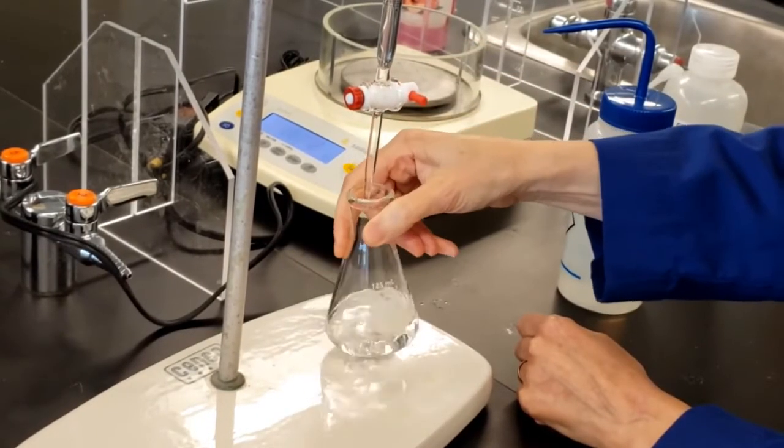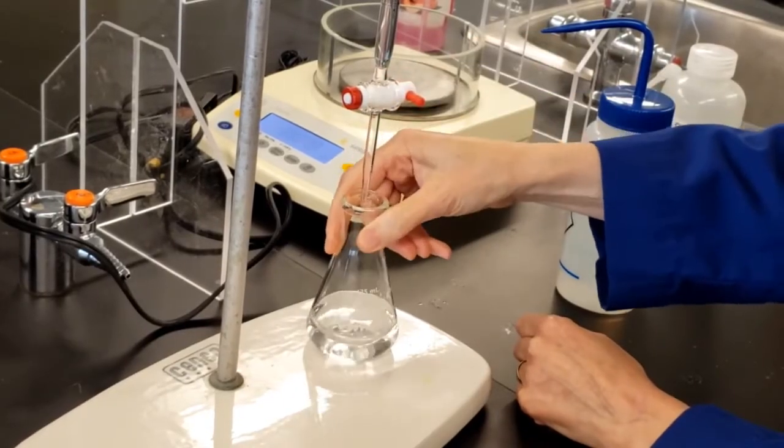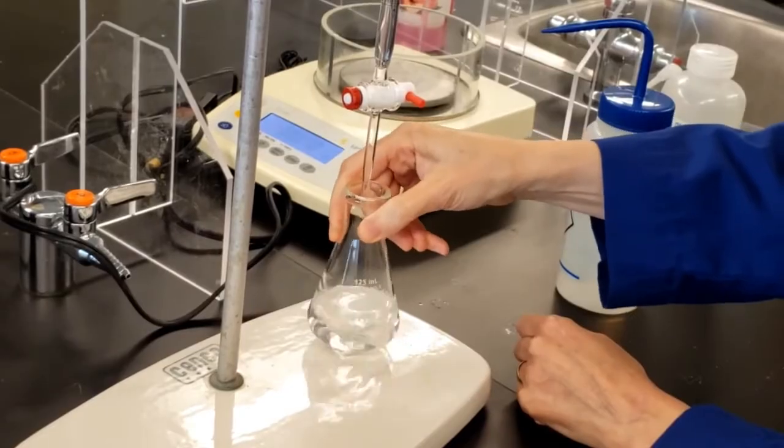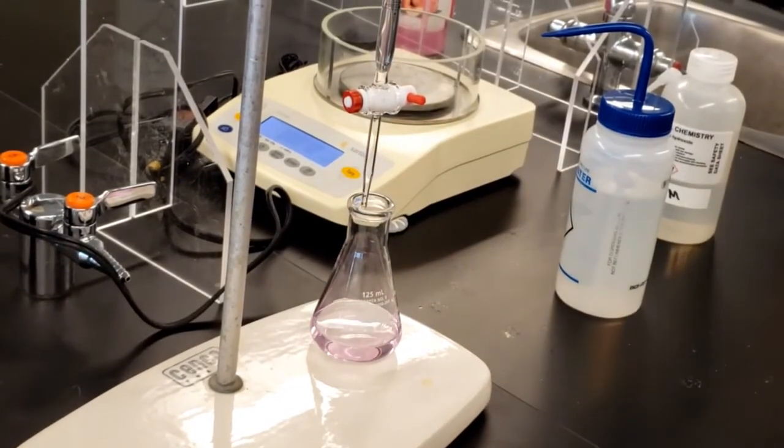Stop the titration immediately when a faint pink color remains for approximately 20 seconds. This is the actual end point of the titration. Record the final burette reading, again to 2 decimal places, in the table provided.